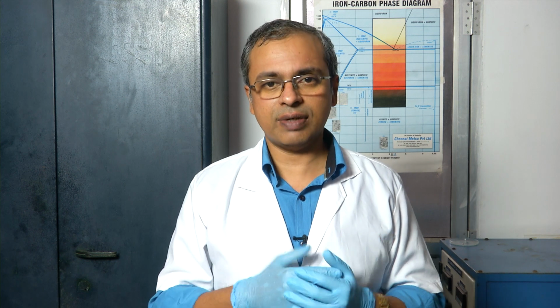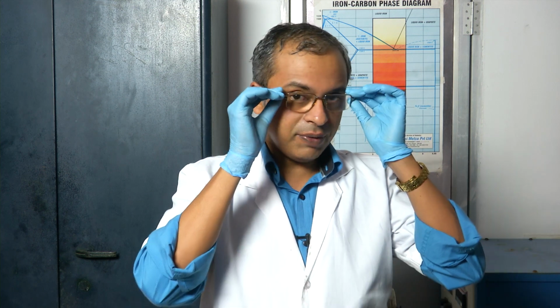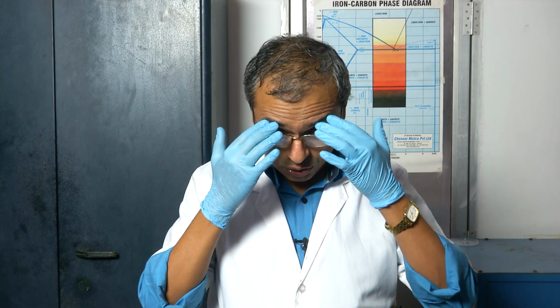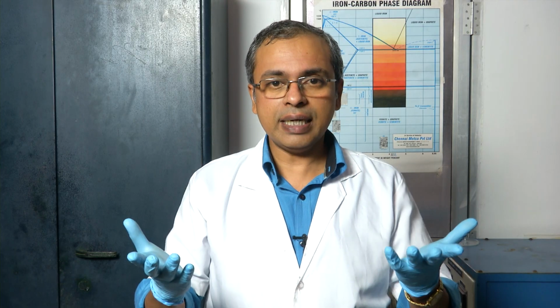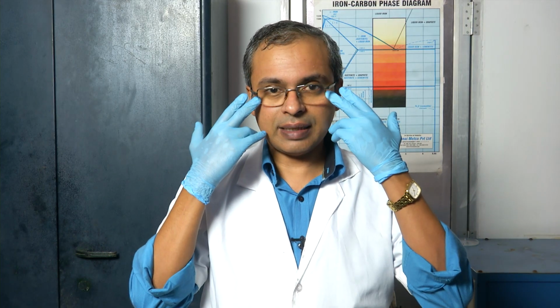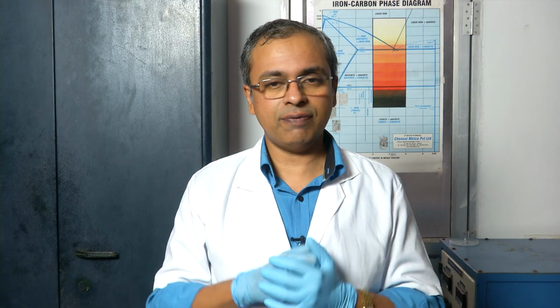So, safety glasses are distinctly different from just a pair of normal glasses. Normal glasses are powered, they have been designed for my eyesight, and that is why I am wearing them. But there are two aspects of this glass which make it inadequate as a safety device. The first is that it does not provide me with complete coverage. You can see that the side of my eyes are open, top is open, bottom is open. So, if I am doing any experiment, if something spills, there is a fair chance that it can reach my eyes, and that is something that we need to avoid.